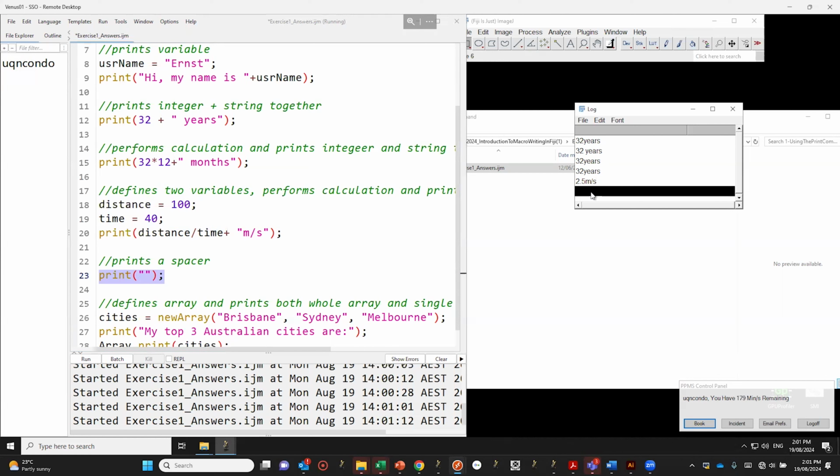Where did I put the output directory? And then it's like, I'm opening image 1. What did it do? Did everything pass? How many nuclei did it find in image 1? And then it will say opening image 2, and how many nuclei did it find in that? So you might want to put spaces and some formatting things so that it's easy to read down the track, right? Rather than just a big wall of text.